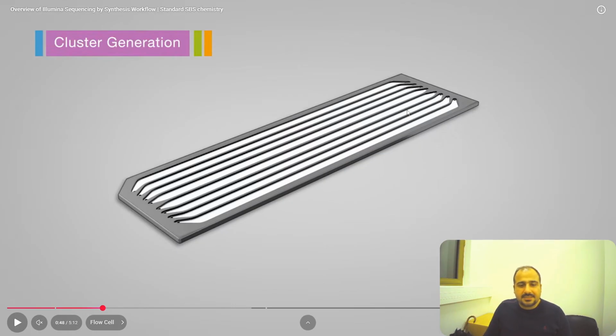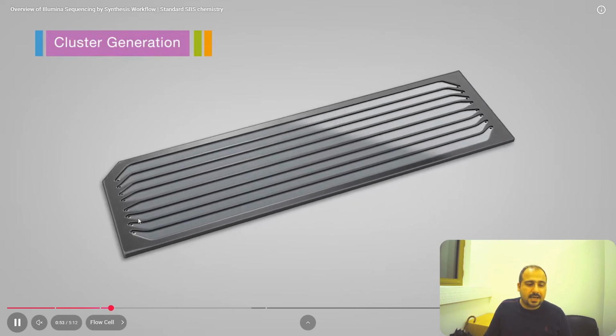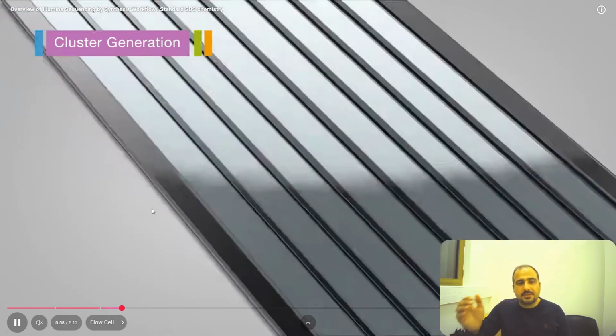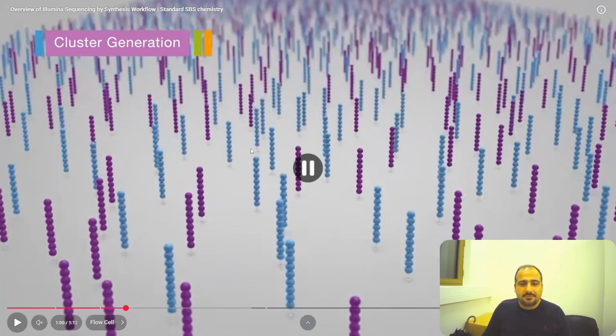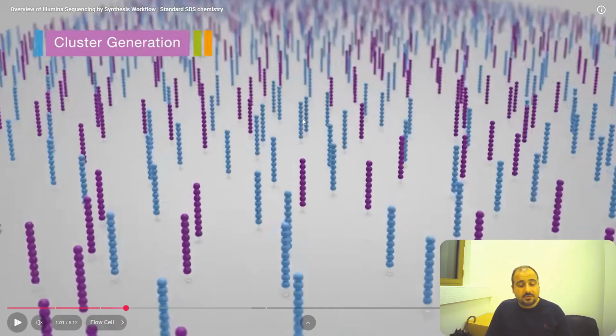And what you can clearly see here is an example of an Illumina flow cell, which typically contains 8 distinct lanes for processing samples. These 8 lanes are all located on a single flow cell, and essentially they are 8 channels where the patient's DNA fragments are loaded. These individual fragments attached to the flow cell are complementary to the primers that we attach to the patient's DNA fragment.